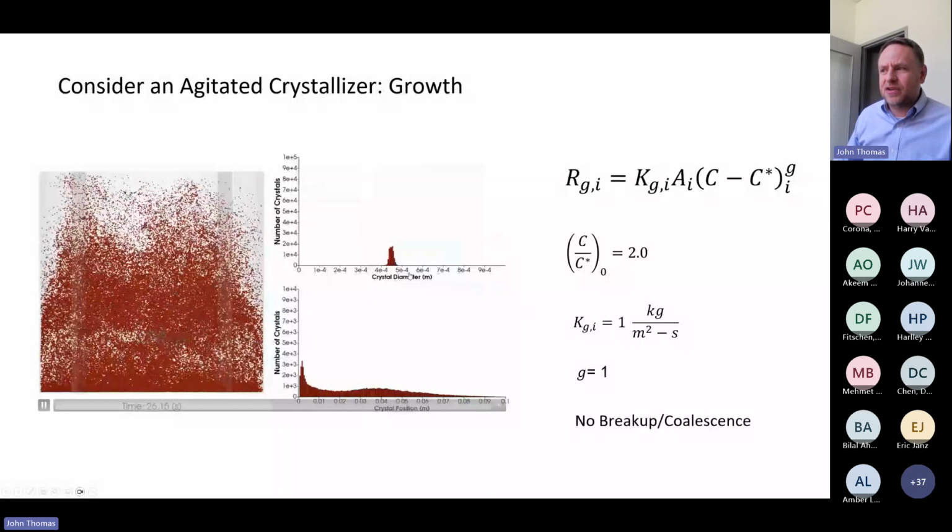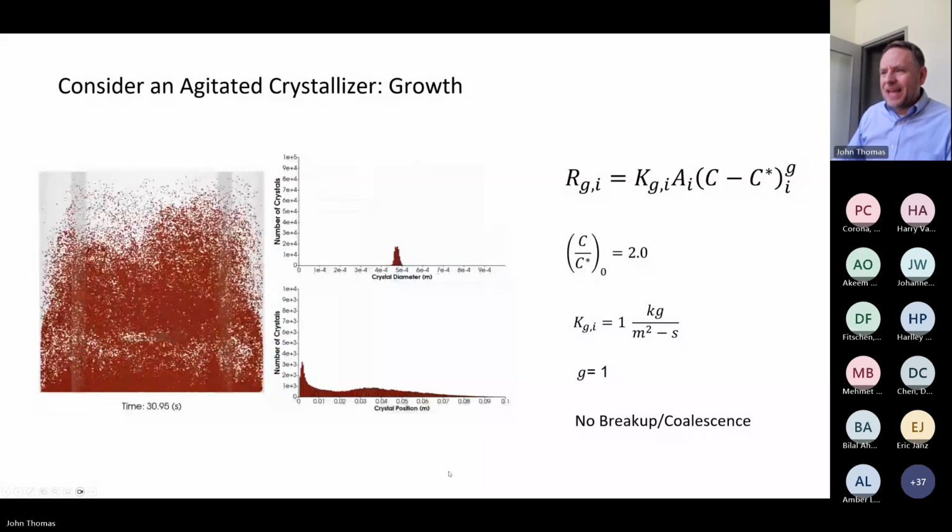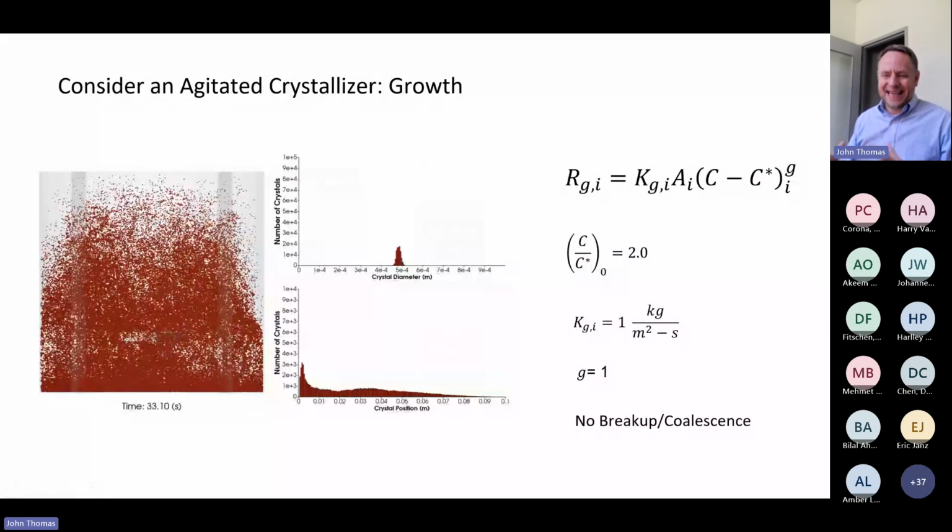And these are beefy crystals, and I kid ourselves. These are like 500 micrometers. They're big, but I'm just being demonstrative here. As they're growing, they're settling.